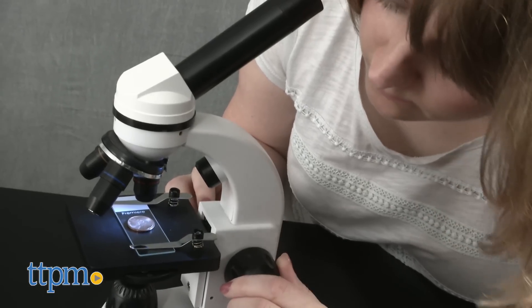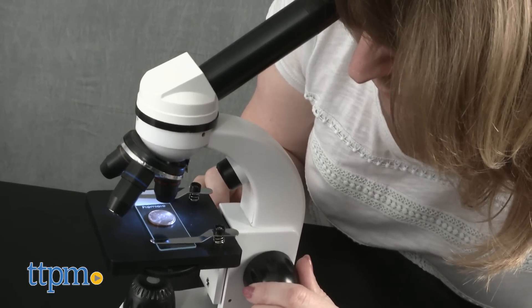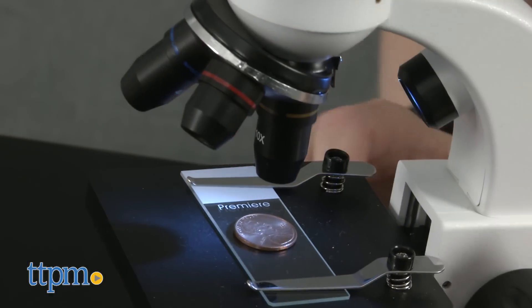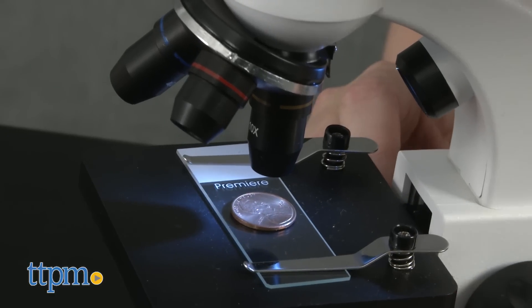This gives young scientists ages 9 and up the same features of a professional microscope, but in a size that's right for them. Because it runs on batteries, you don't have to plug it in anywhere, making it great for kids to take with them when they're out in the field.